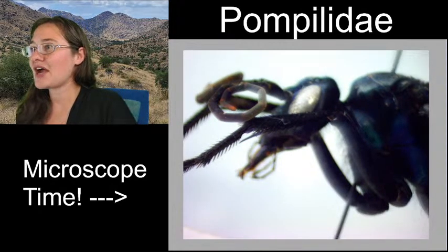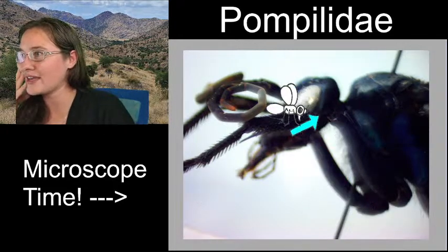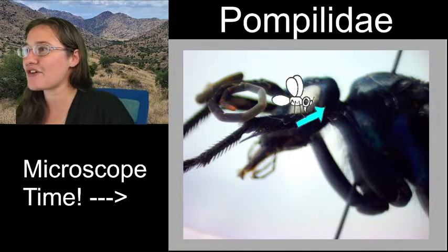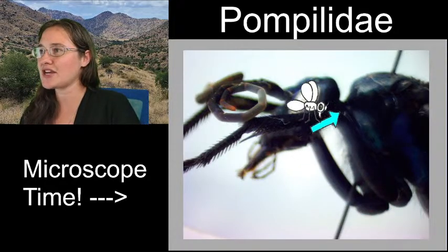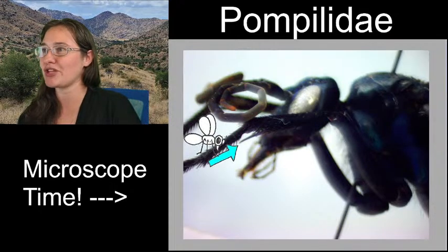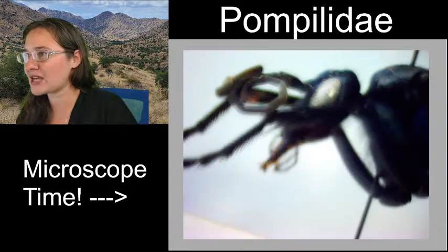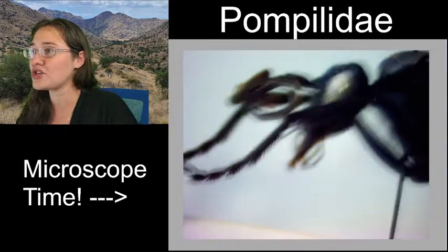All right, so I wanted to go ahead and zoom out a little bit so that I could see this leg here. Our wasp is taking a while to sketch. I'm sorry about that. All right, so we're looking at here. This is our femur, and this is our tibia. Our femur is kind of wider at the base and kind of more narrow at the top. And then our tibia is nice and thin, and it has that really awesome tibial spine. So we can check that out for sure. And then moving forward, any of those segments after are its tarsal segments or its little toe segments.